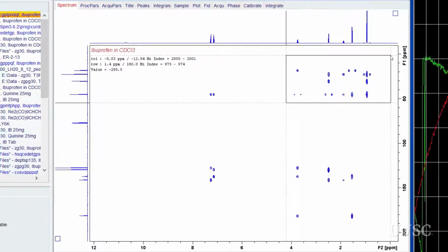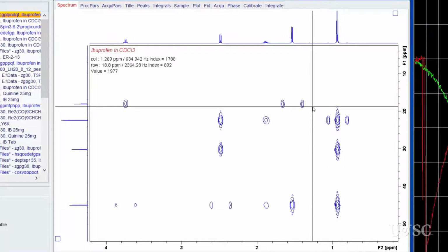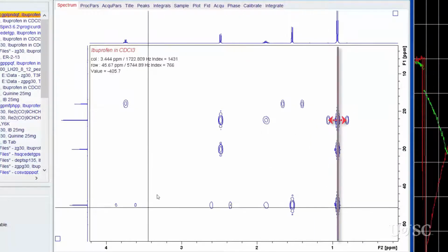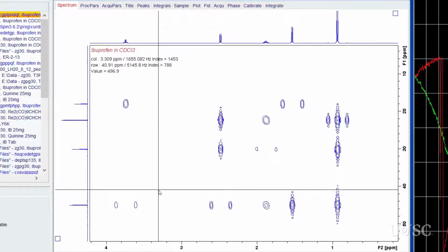In the aliphatic region, the intensity of the cross-peaks is similar for both the 2 or 3 bond cases. Just outside of the columns appear 2 peaks that form the doublet of the single bond correlation. These are usually lower than the cross-peaks for that proton resonance.